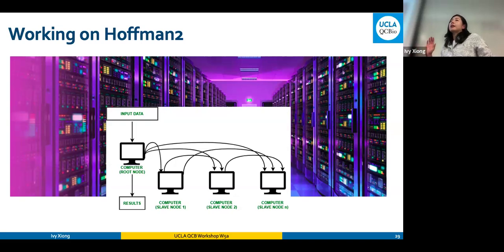For example, if you have any computationally intensive task, don't do it in the login node. What we want to encourage everybody to do is request an interactive node. We request an individual node so that if I'm messing around with it, nobody would even find out. That's what we want to establish today, so everybody will be comfortable working on Hoffman 2, and we know how to request an interactive node. We want to do simple file manipulations, quality control, and filtering. That's the goal of today.